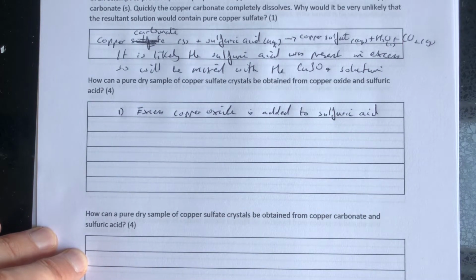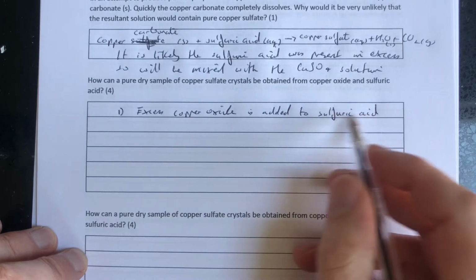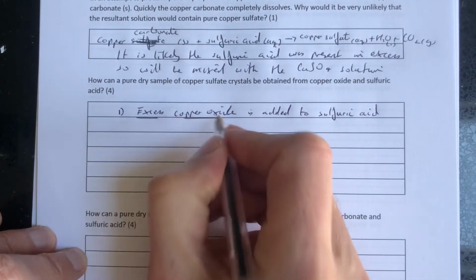Because the sulfuric acid is aqueous and the copper sulfate that's made is also aqueous. So if we had any sulfuric acid remaining, it would mix with the product and therefore the copper sulfate wouldn't be pure. So we have to have excess copper oxide, crucial.